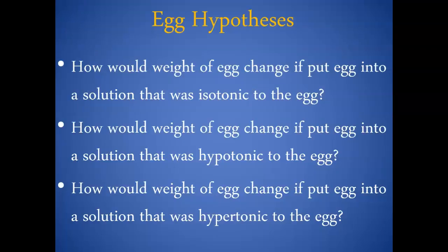Then I'd like for us to think about a hypothesis related to osmosis within the egg. How do we expect the egg, or the weight of the egg, to change if we put it in a solution that is isotonic to the egg?